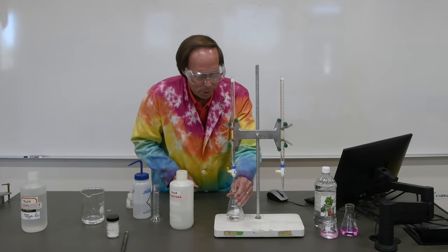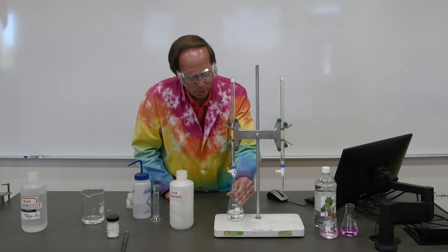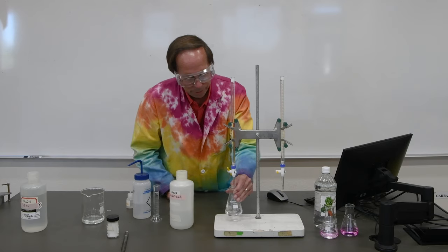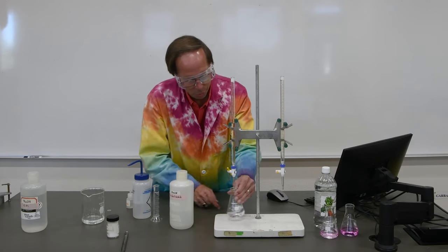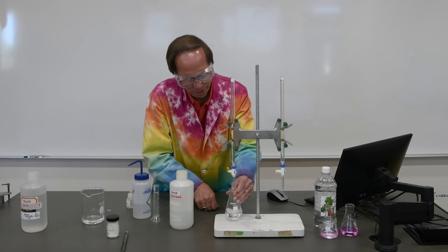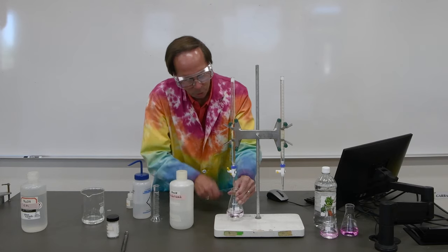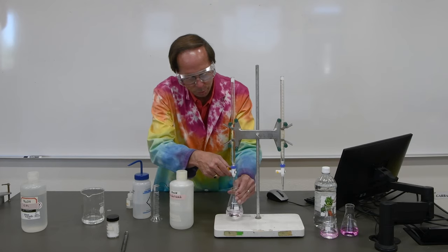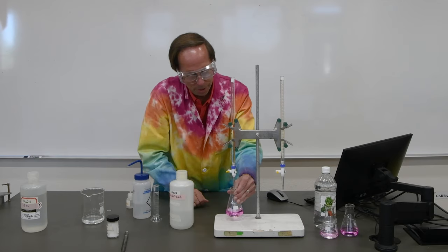There we go. Drop and swirl. You may not see the drops, but every time I swirl it, that means a drop has just fallen in. And again, I'm not going to look at the burette. I don't want to know where the volume is. I'm going to stop when the color change tells me to stop and accept that result, whatever it is. Yeah, the pink's starting to hang around a little bit longer, so we're probably getting pretty close here. Yep, I think we've got it.